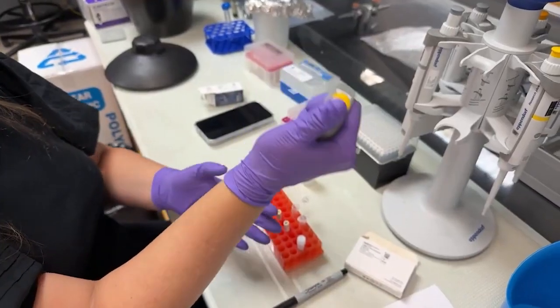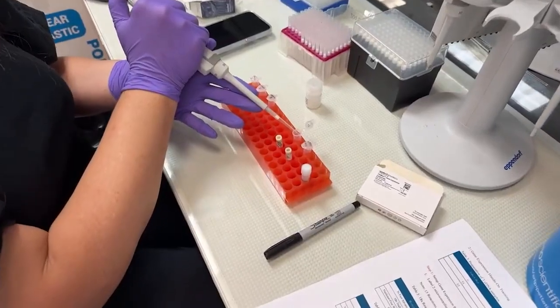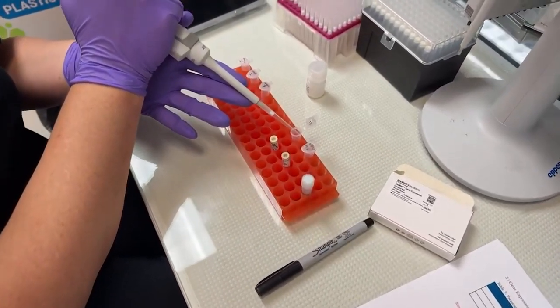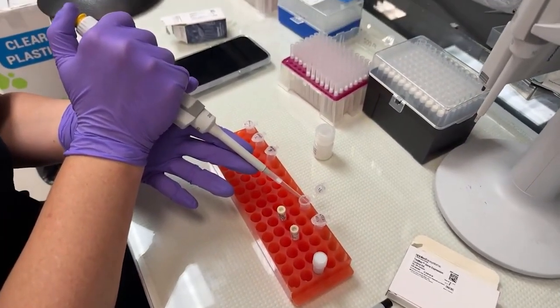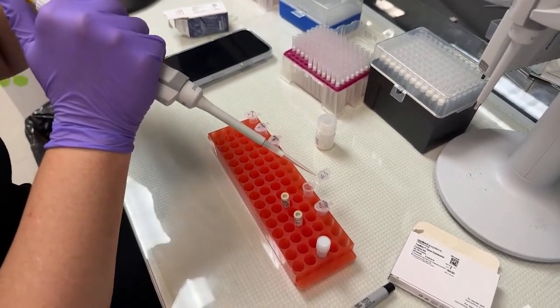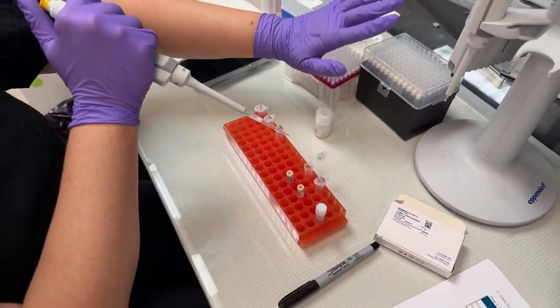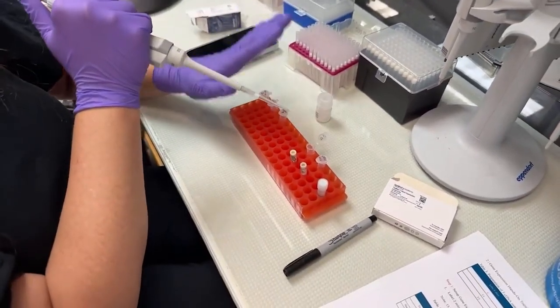And then I move to the tube that it's going to land in, and I slowly depress that plunger, and then I go past the stop. What that does is it takes an extra reservoir of air and pushes the rest of the solution out of the tip so that I get everything I picked up.